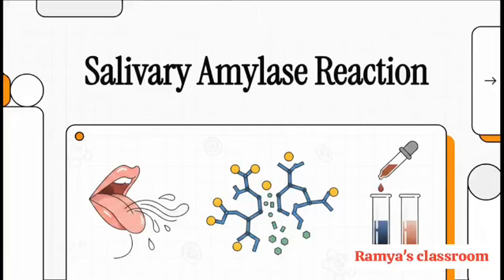Today, we're bringing the laboratory right to your screen with a really exciting biology explainer. Have you ever stopped to wonder what actually happens the exact moment food hits your tongue? Well, today we're exploring a classic foundational experiment that reveals the invisible, almost magical chemistry happening in your mouth every single time you eat. We are looking at the salivary amylase reaction on starch digestion.